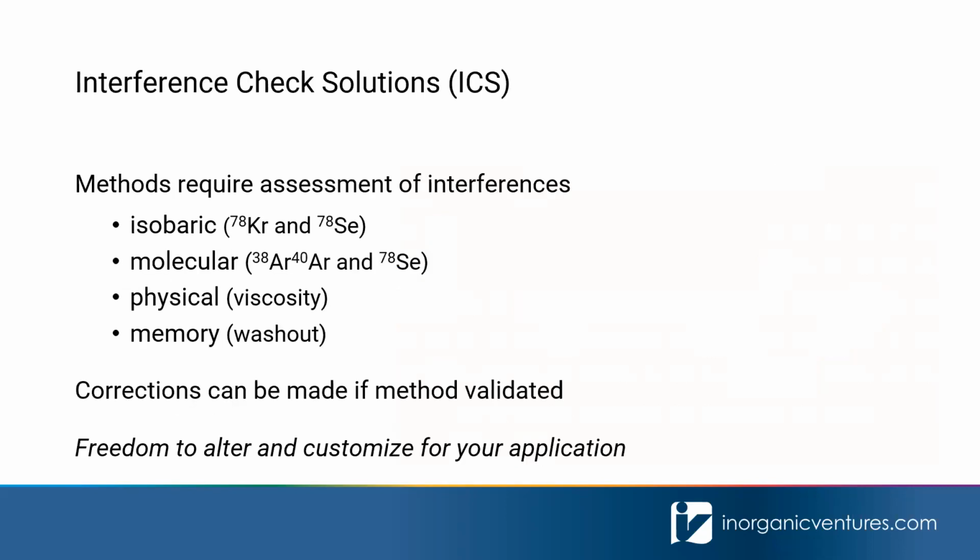So what do you do about interferences? Regardless of the method, whether it's EPA, ASTM, or standard methods, they generally have some passage in the method that says you have to perform an assessment of different interferences. And we have 4 different types of interferences listed here.